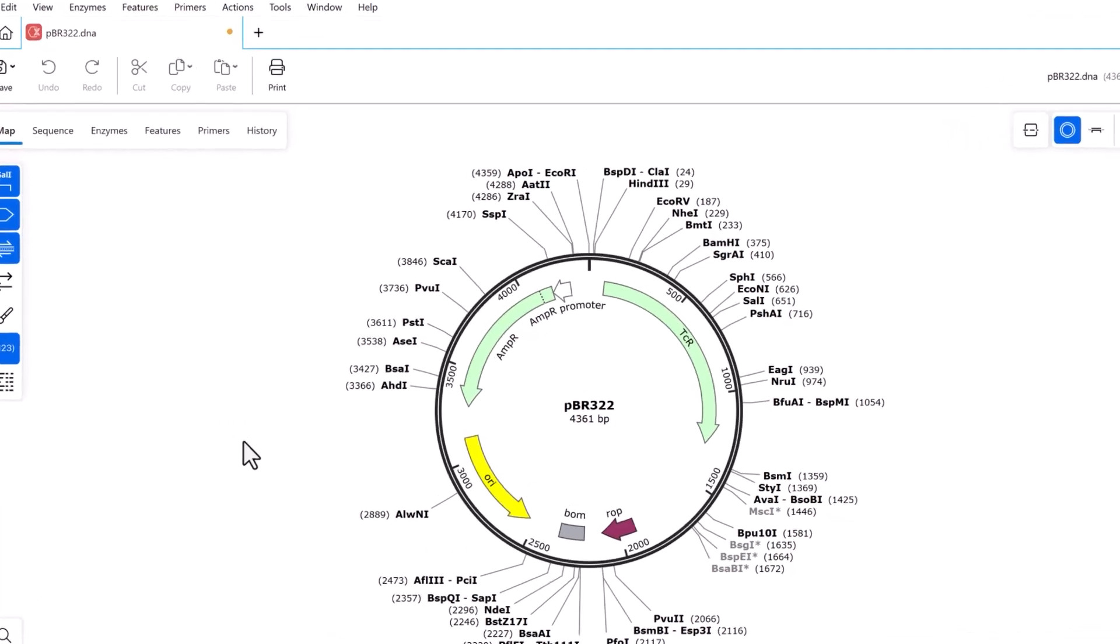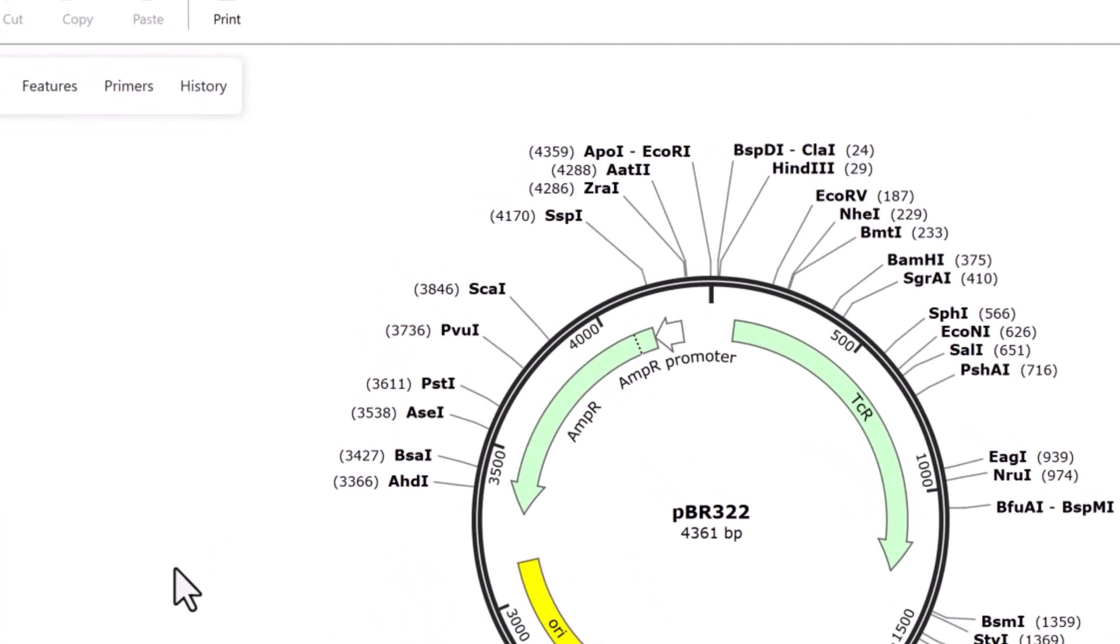Restriction enzymes that only cut once are marked in bold, and the hover option allows you to access more detail easily.